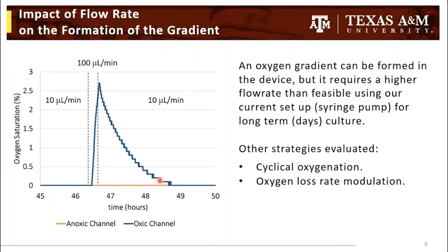And so after seeing these results, we were curious as to whether we could try to recapitulate other sorts of oxygen heterogeneity by using our device. And so I'll just briefly describe two other promising strategies that we evaluated thanks to the ID developer's kit in our system. So the two strategies that I will talk about are cyclical oxygenation and oxygen loss rate modulation.